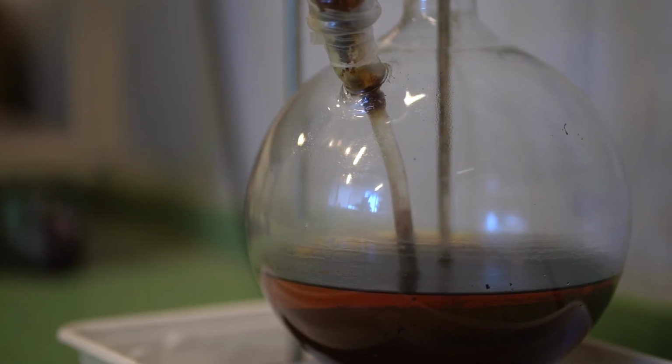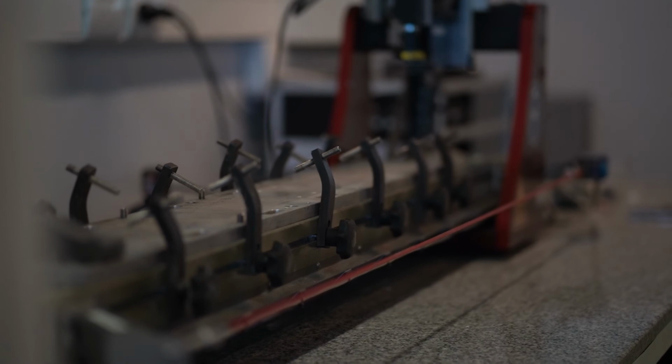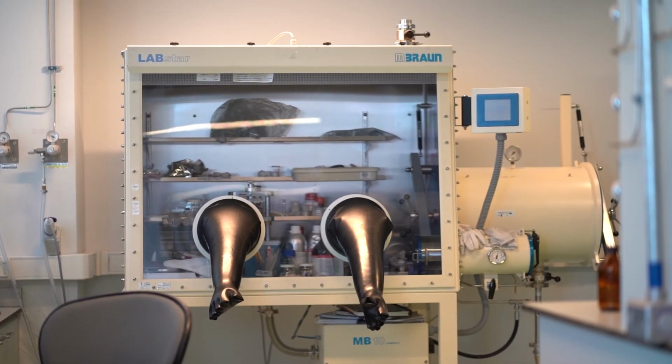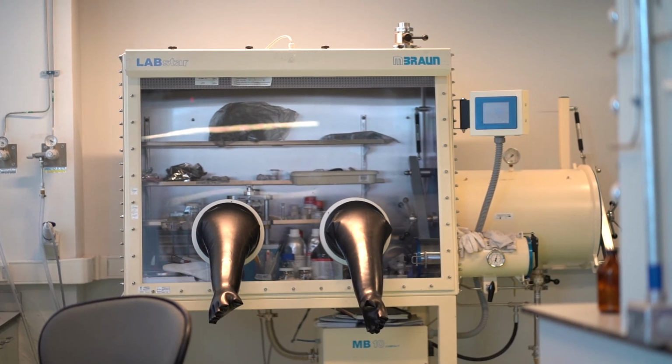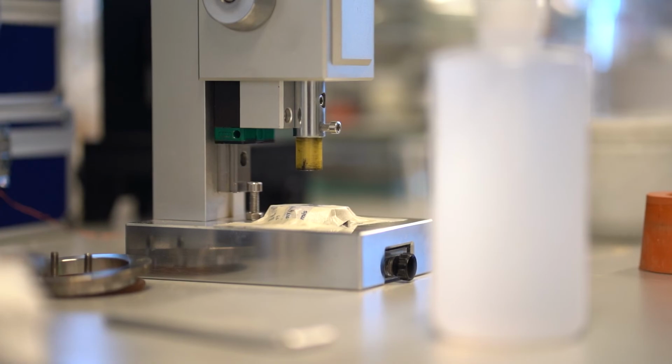Now that we characterize somehow this sample and that we have performed experiments and then we have modeled these experiments with success, we want to use this for some practical purpose. So sandstones are known to hold water in them. Some aquifers are in sandstones, for example. Or in the context of CO2 storage, some sandstones, as the Utsira sand, are used to inject CO2 into them.